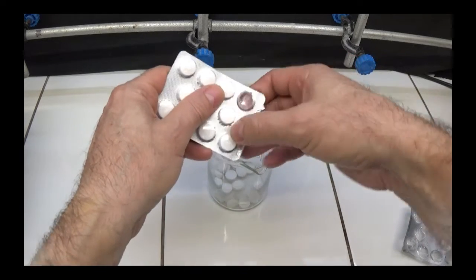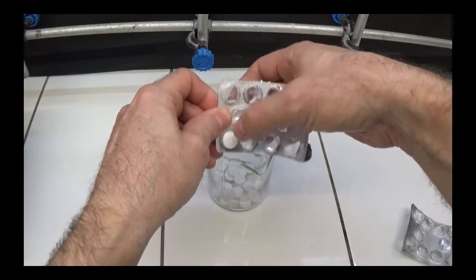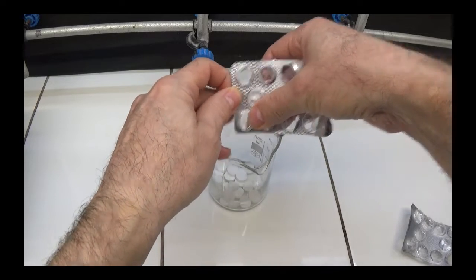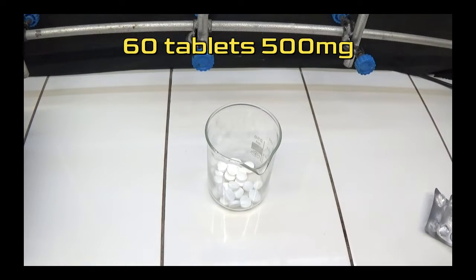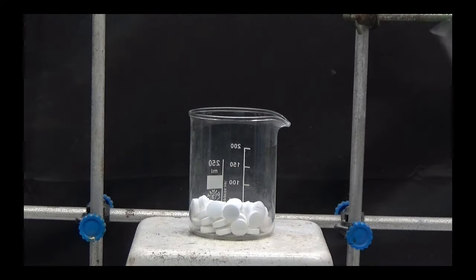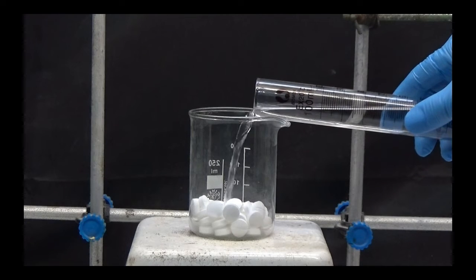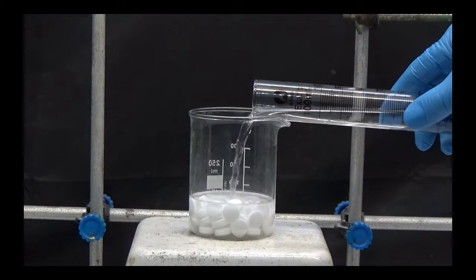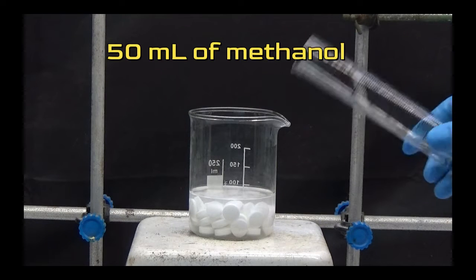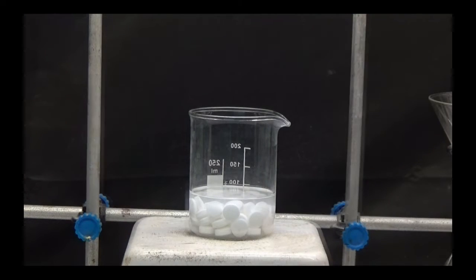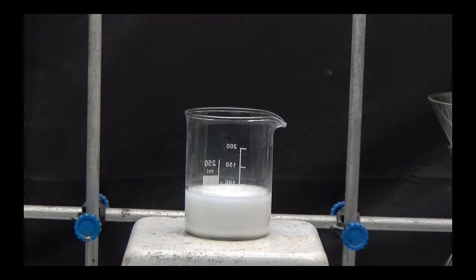First, we extract acetylsalicylic acid from commercial 500mg tablets. In a 250ml beaker, we put 60 tablets of 500mg of acetylsalicylic acid. Cover them with 50ml of methanol and let them rest for about 20 minutes until they disperse. We stir for 10 minutes.